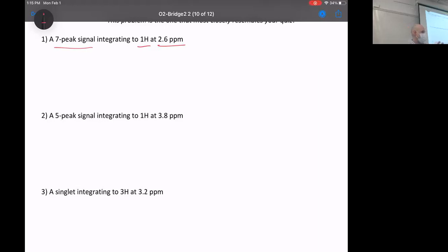The only time that I would recommend going in a different direction to start off with is if your chemical shift is above 5. So let's say your chemical shift is 10 to 12. What does that tell you? 10 to 12 ppm. Yeah, carboxylic acid. And so at that point, you're not really looking for what you're near. It's just that's what defines what you are. But being in these regions like 2 to 3, these are probably just alkanes or CHs that are near stuff as opposed to being part of stuff.